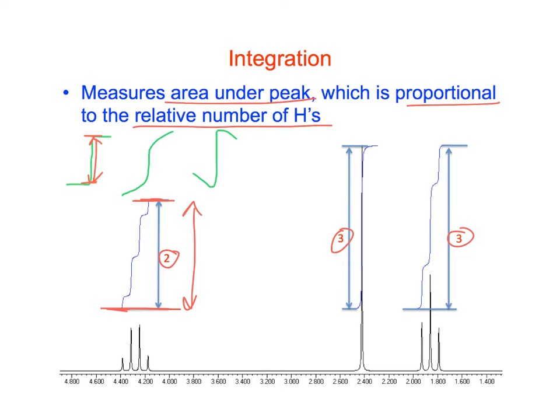And so there are some parameters that you can go in to adjust the integration lines, and so they can be adjusted to look like this. So that's what the curve helps you with when you pick the 2 points that you're going to integrate from: to figure out where there actually is signal and where there's no signal, because it goes flat.